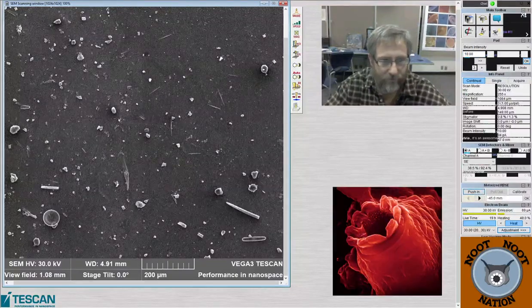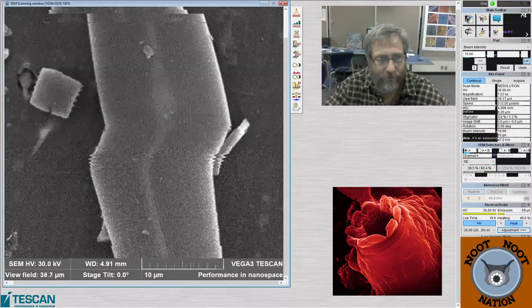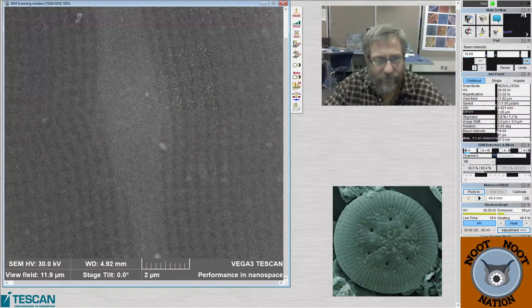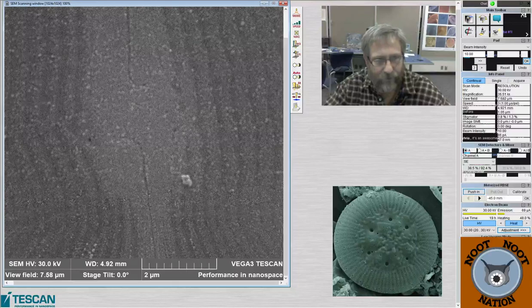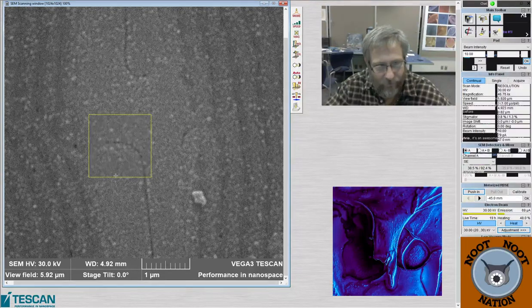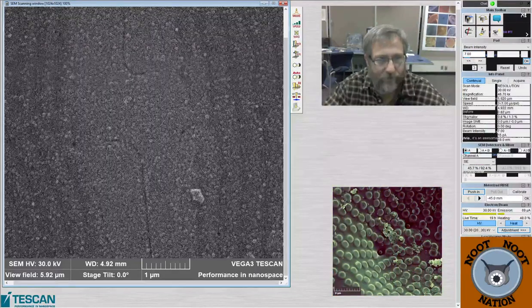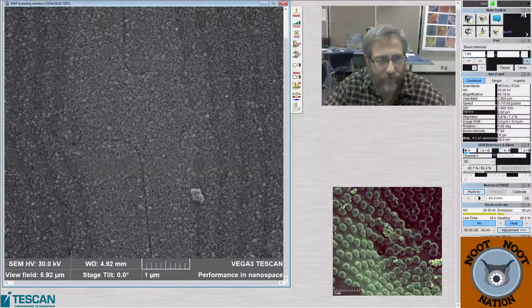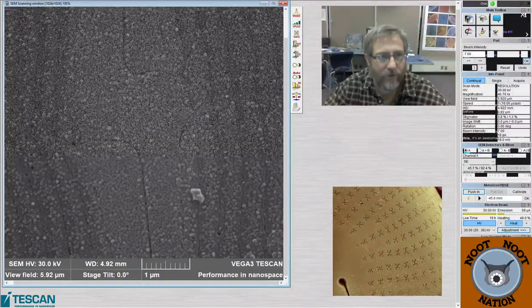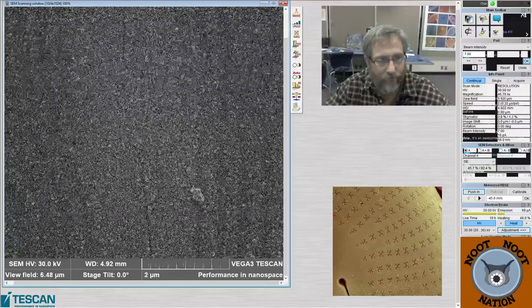So, this is Stephanodiscus, and this is a Gyrosigma that does not have the central area all covered with junk. So hopefully we can get a nice clean view of it. I mentioned that some of the other diatoms besides Nitzschia have raphes that go in opposite directions when they get to the center, and this is one of them. So when we switch down to beam intensity 7, you can see here's the raphe, and it curls this way, and from the other direction it curls the opposite way. So a characteristic of Nitzschia, but also a characteristic of Gyrosigma. And I think Pleurosigma too.